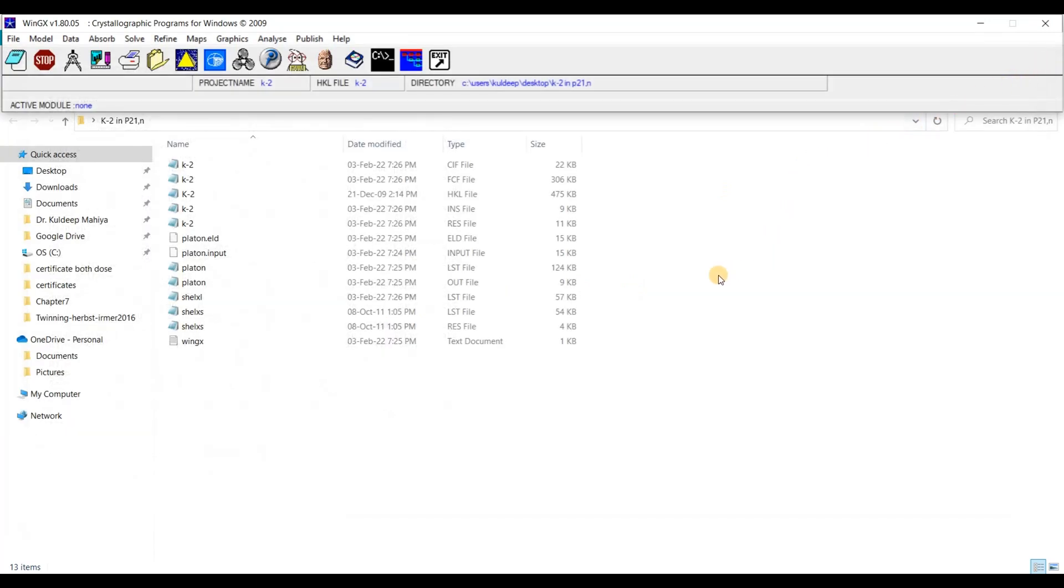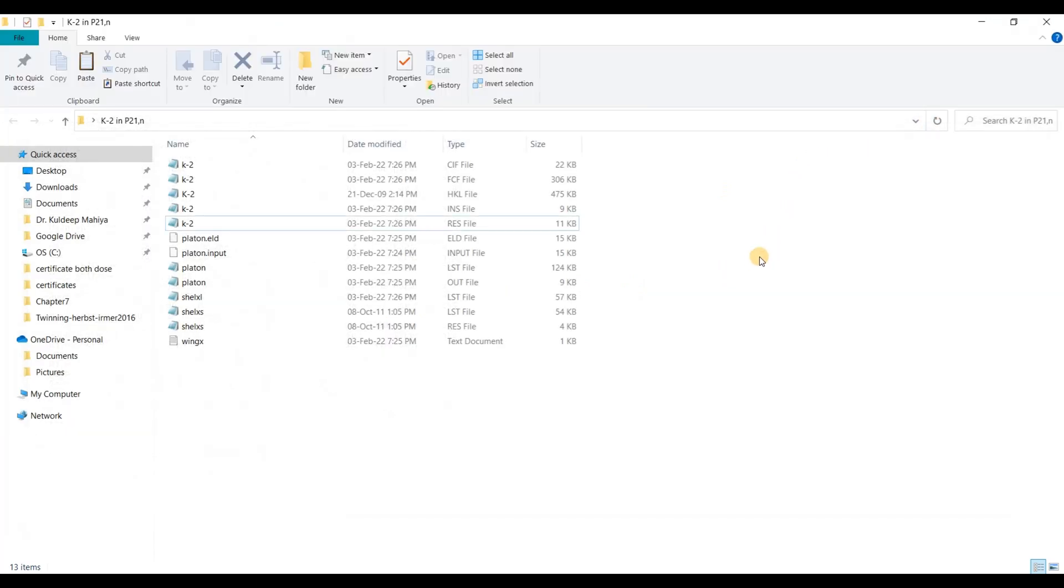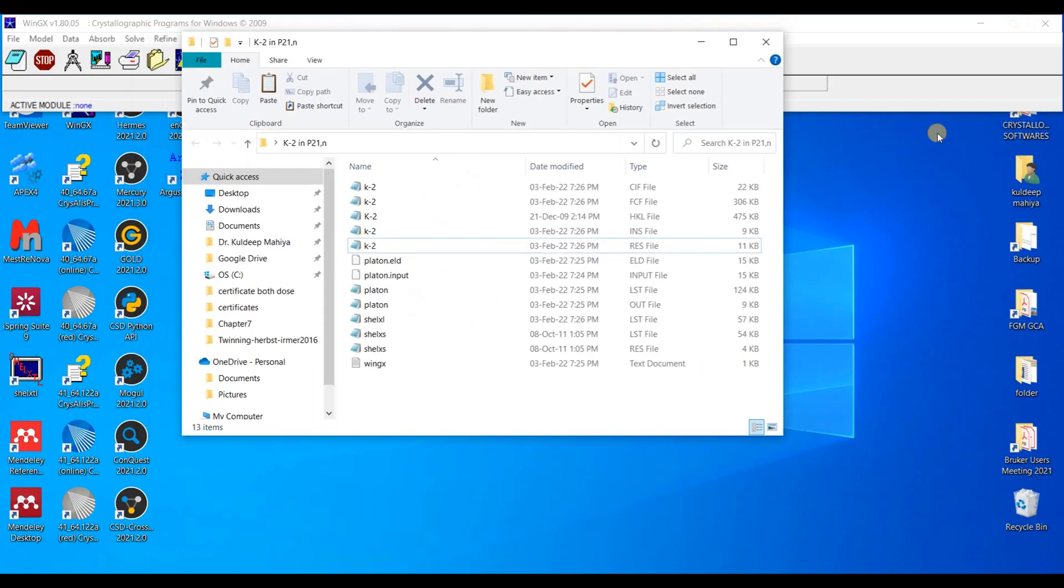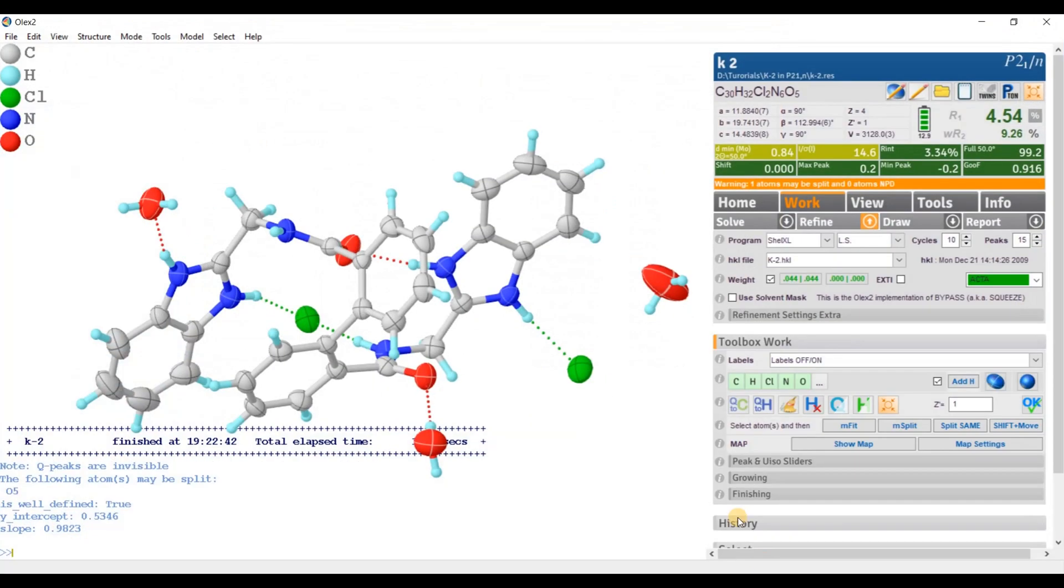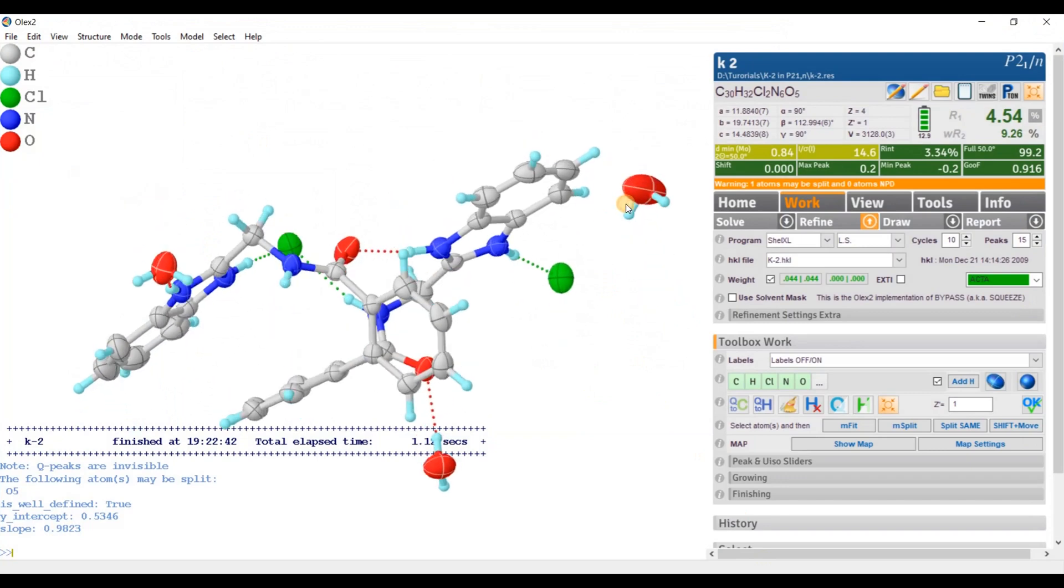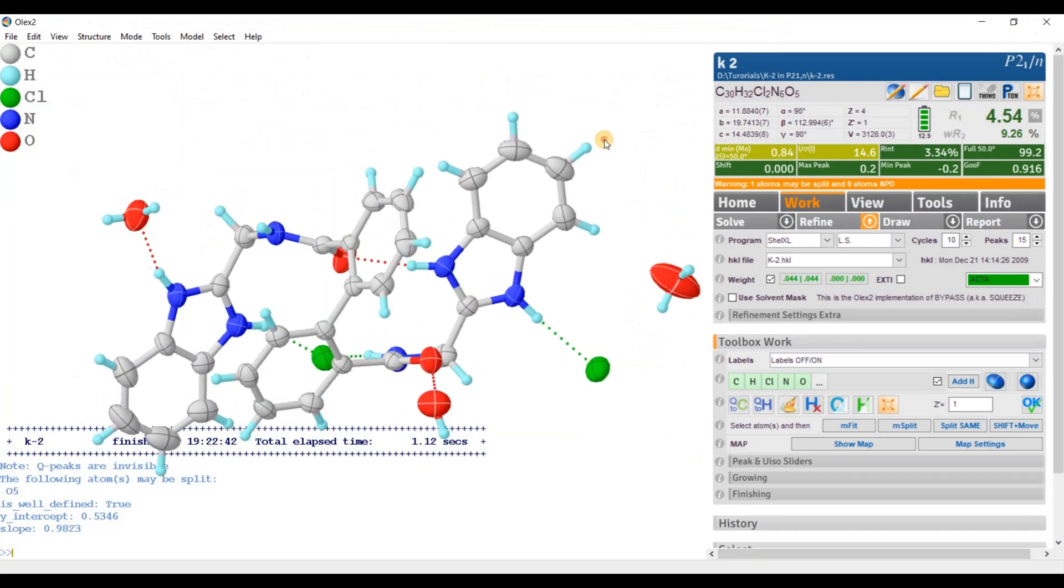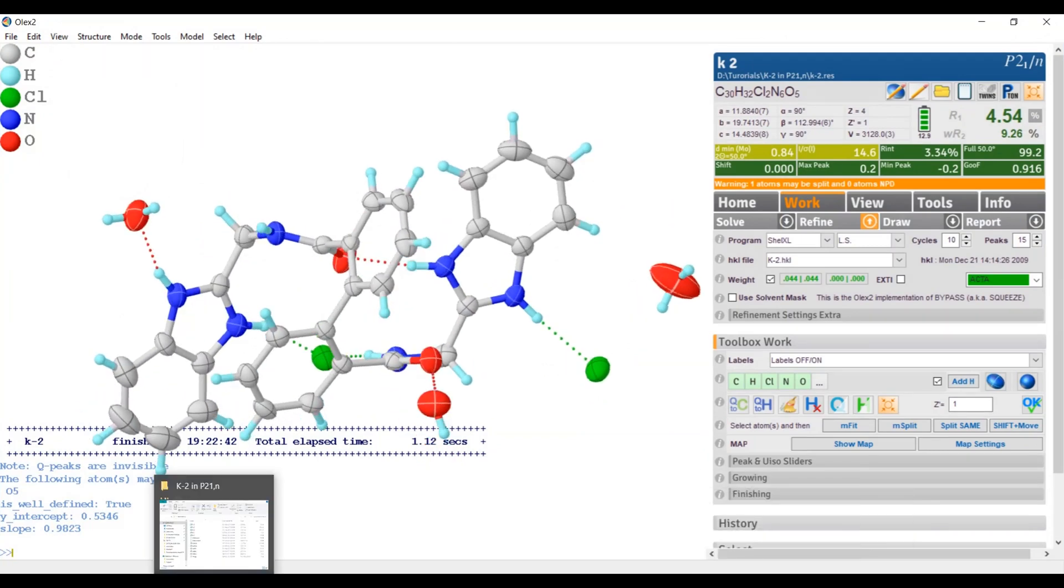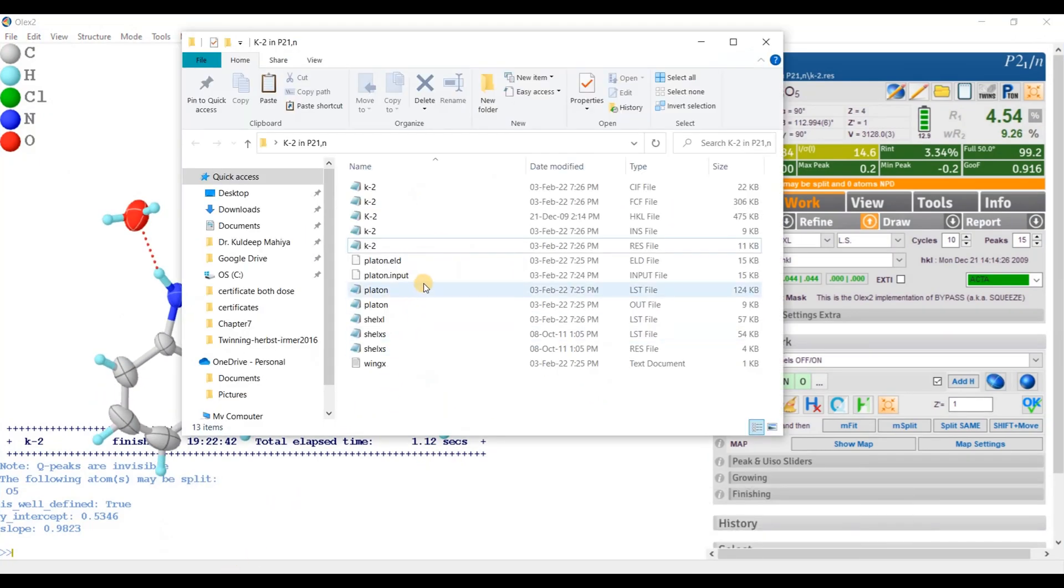Okay. Now look the file. Let's look the file in Olex2. I am using Olex2 again, opening Olex2 and I am opening this folder.